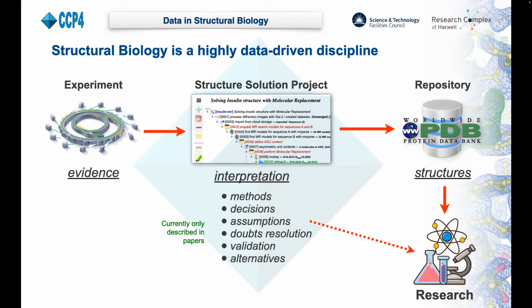Structural biology is driven by data. And from the application point of view, structural data is what is kept in the PDB. But in reality, PDB structures are only interpretations of experimental evidence, or diffraction data. The structure solution projects then are links between the evidence and the final interpretation, and therefore they are part of knowledge generated in the course of a particular study.